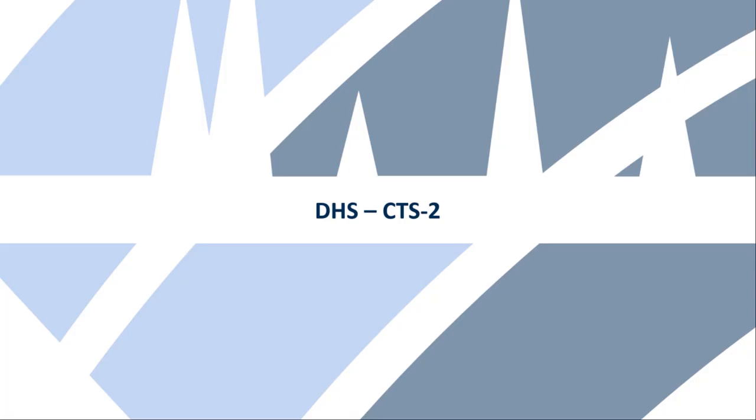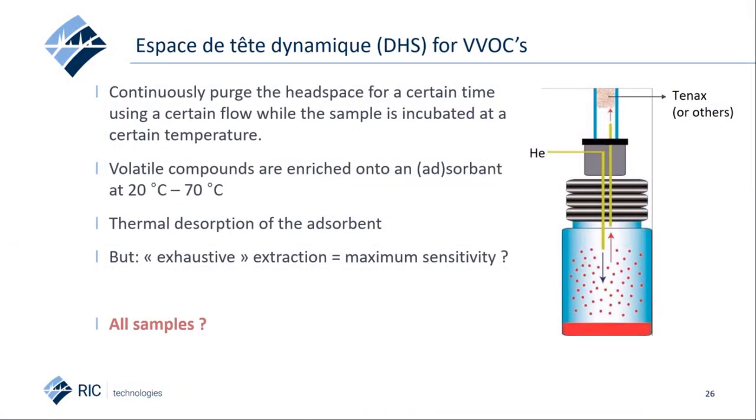Let's move on to what on-column refocusing can contribute to a dynamic headspace enrichment approach for the analysis of very volatile and volatile compounds. The dynamic headspace technique involves a continuous purging of the headspace of the sample, increasing this way the sensitivity obtained, compared to static headspace, but maintaining the low selectivity and so the high ability to do more complete VOC profiling.